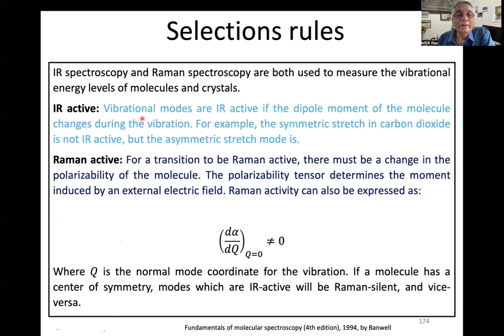If you look at the IR active modes, vibrational modes are infrared active if the dipole moment of the molecule changes during the vibration. For example, the symmetric stretching in carbon dioxide is not IR active. But the asymmetric stretch mode is IR active.